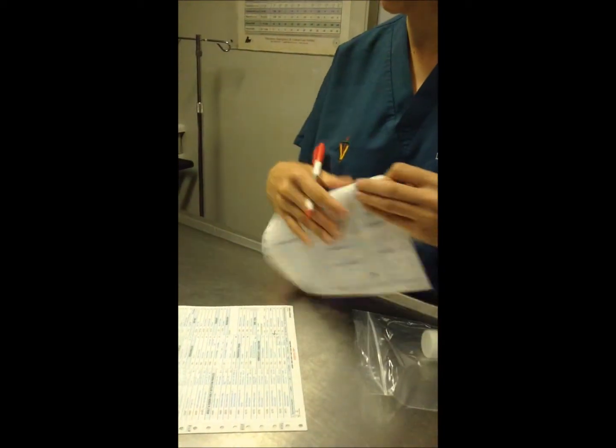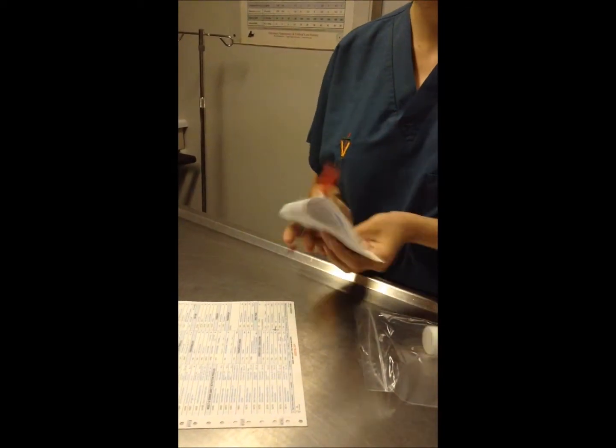And then you stick it. And one copy of it goes to them, and one copy you keep here for your own records. Now it goes in the fridge.